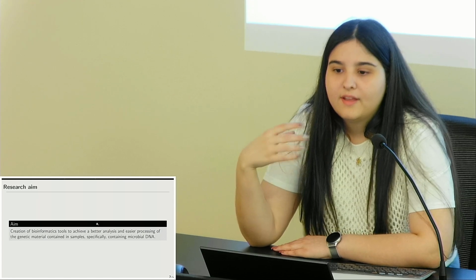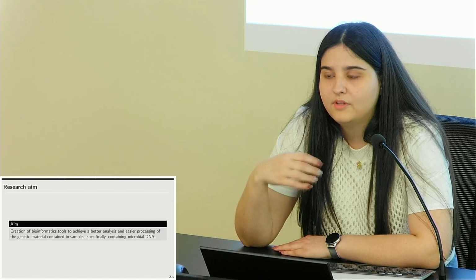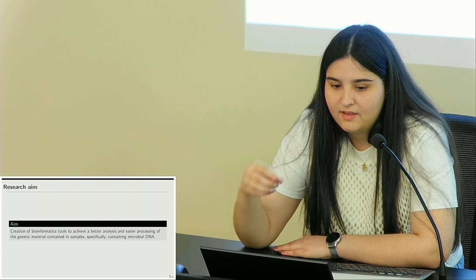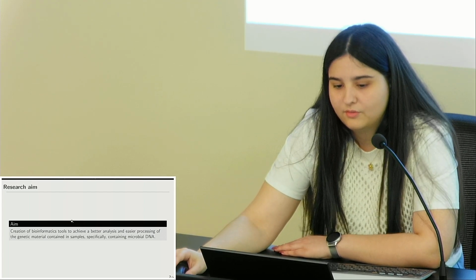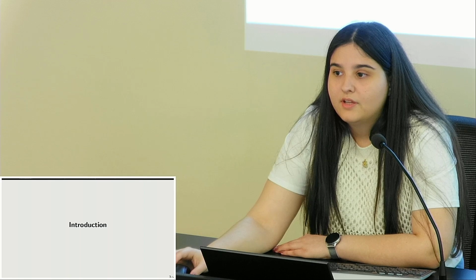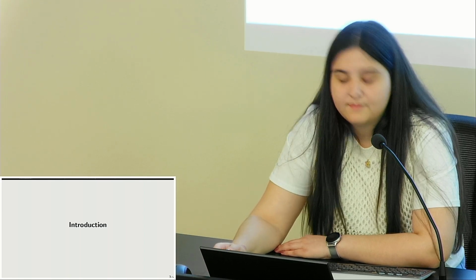These tools were created in collaboration with the Oral Sciences Research Group from the Faculty of Medicine and Dentistry. And we usually publish the clinical point of view and also the technical approach to create these tools. I'll start with an introduction to several concepts related to metagenomics.